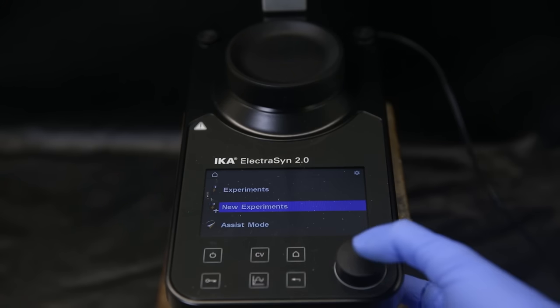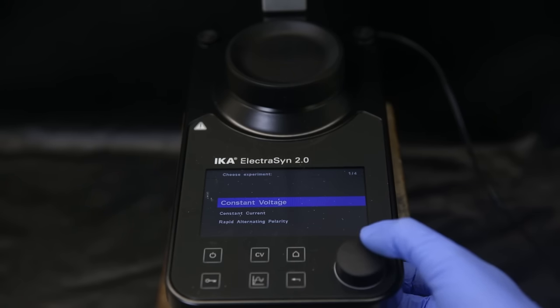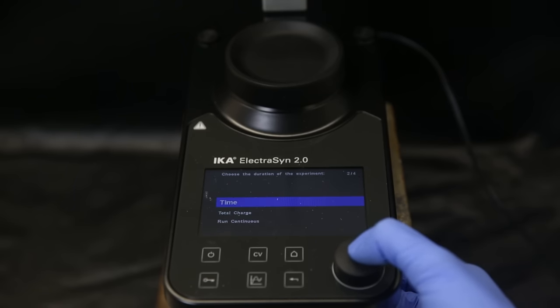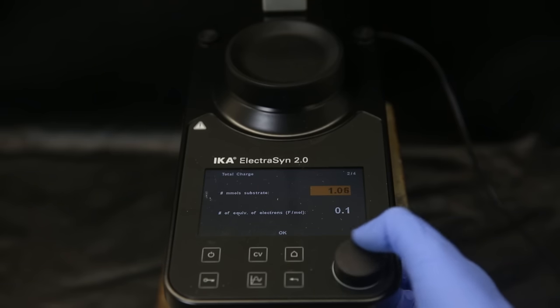First, I go to new experiments and then select constant current since that is what the literature requires. I use the same value as them, which is 12 mA. I'm not using a reference electrode, so I select no. I then select the total charge that should be supplied by the device, which for electrochemistry is measured in Faraday per mole.